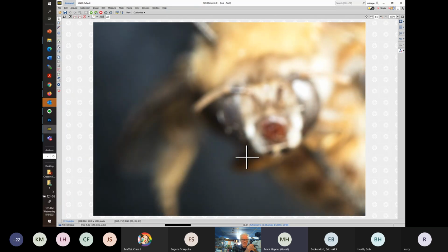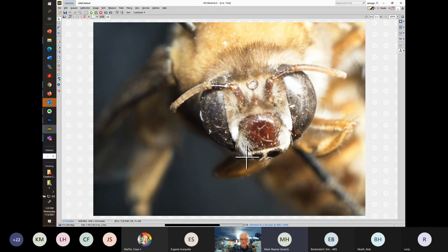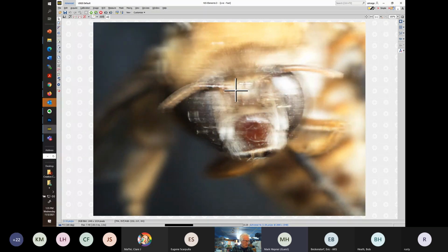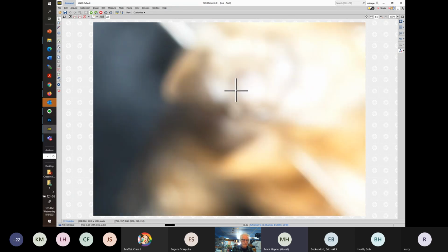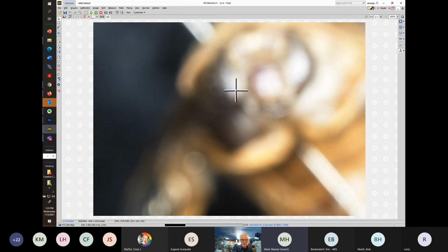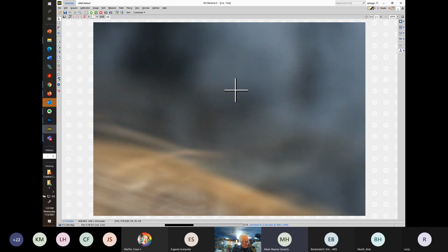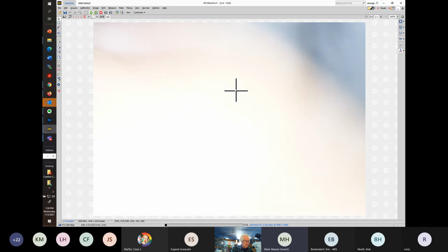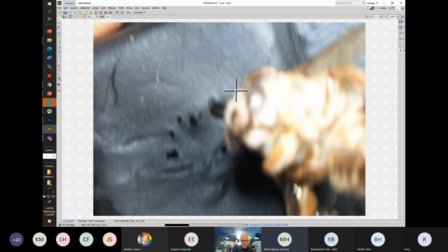If we look at the face, we see a big ocelli for some reason, but we'll pocket that. These eyes are parallel. We see a clypeus, not super long antennae in any way. If we take a look at the labrum, these are useful at the genus level. Well, let's see if I have to put it even further upside down, the labrum and the mandible.